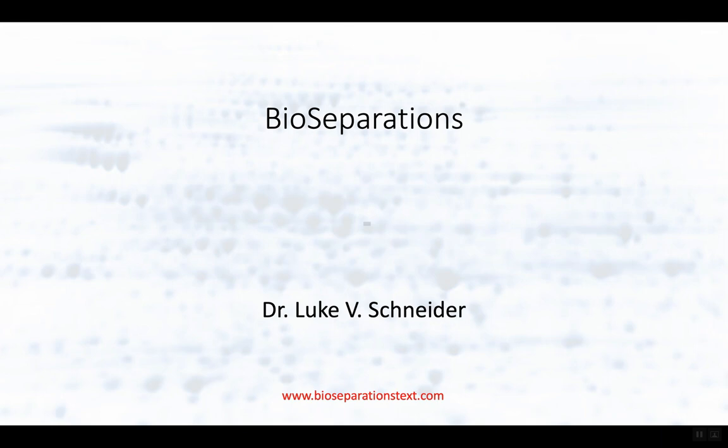All right, so those are the two ways to model electrophoresis. There's a very robust way to do it that's almost impossible to integrate or to work with. So we tend to do it through electrophoretic velocities, and we've shown how we can adapt to the Debye layer and the zeta potential of the wall, which generates an electroosmotic flow.